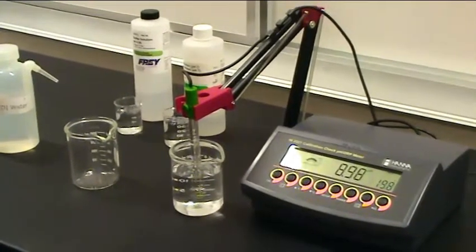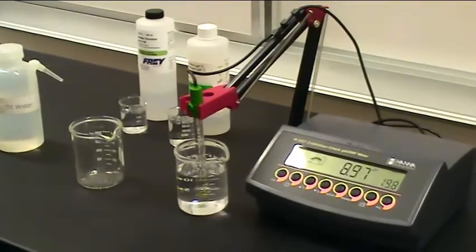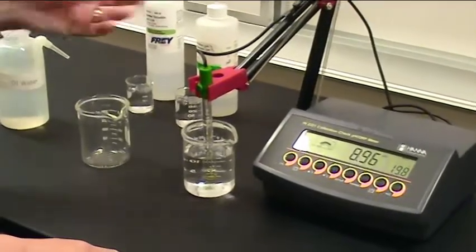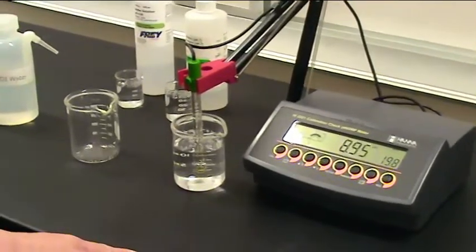Before using a pH meter, it's not going to read properly unless it's calibrated first. So the proper way to calibrate is to have two or three calibration solutions ready to go.